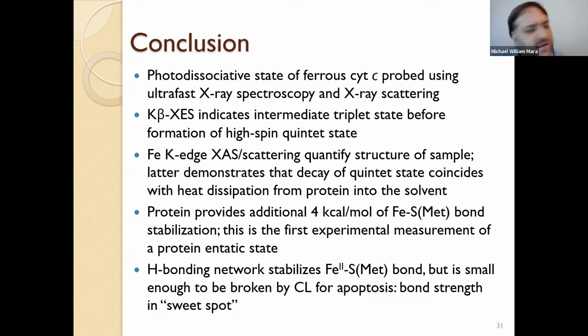The tricky thing then becomes how you extract the local temperature. The heme was beneficial in that the heme has a bunch of very prominent, very strong resonance Raman bands. And the porphyrins had a specific model derived for how the frequency shifts as a function of temperature. I think if you wanted to apply this to non-heme systems, the big key would be how you quantify the active site temperature there. Beyond that, the general methodology used in the X-ray spectroscopy and scattering should still apply.